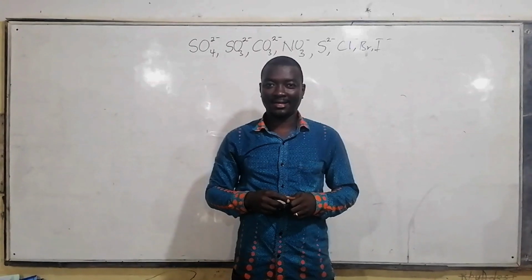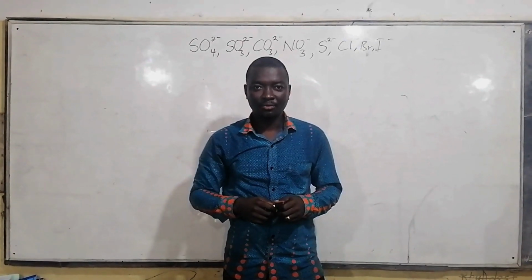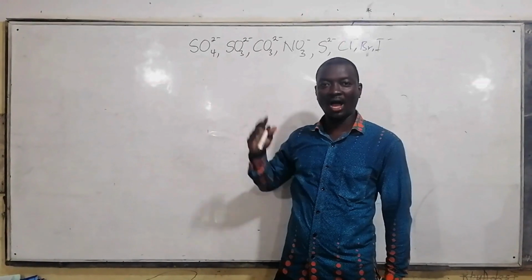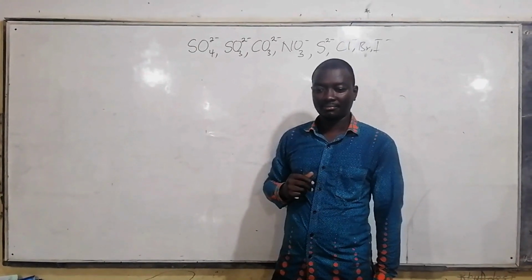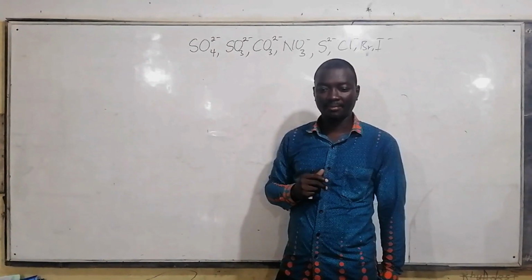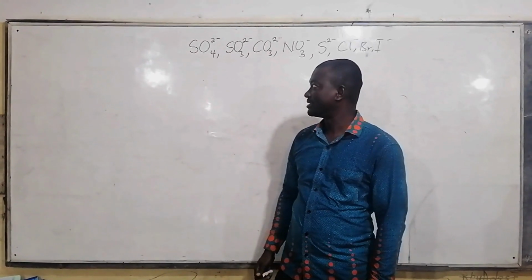Unlike the cations, we don't have two specific reagents for identifying them. So come along, let's see how it is done.